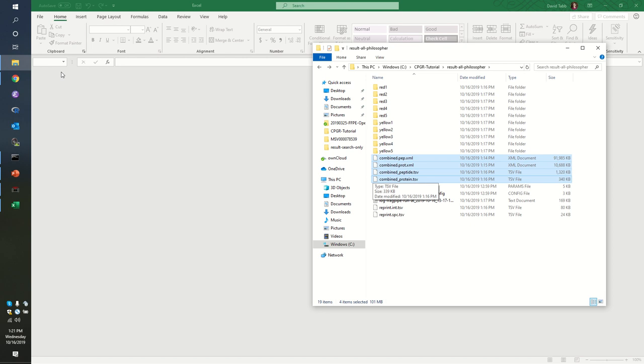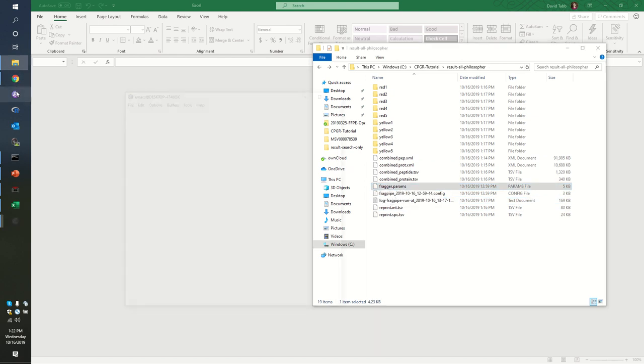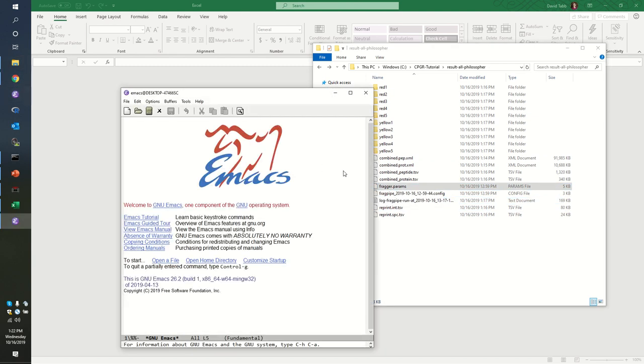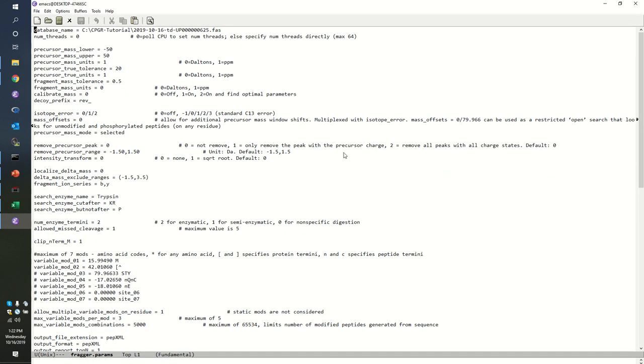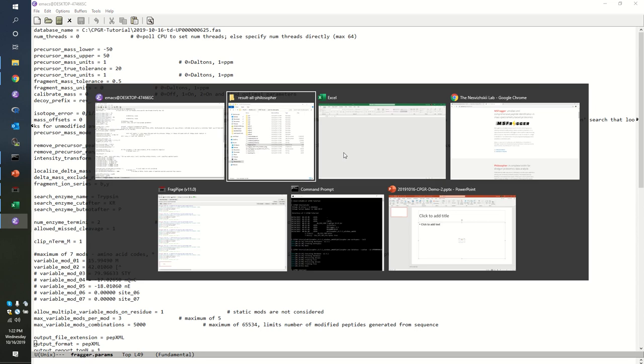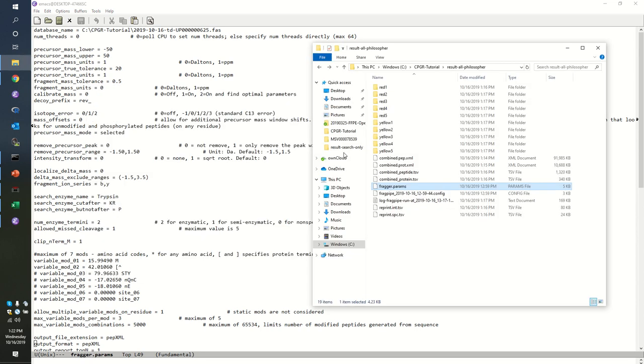These reflect not just a single PEP XML file for just red one or just red two, but rather a combination across those. We still have our Fragger params file, which is awfully useful if we're trying to reproduce this search. For example, on the server, you can see that all of the different parameters that are available to you within MS Fragger are configured within this text file.